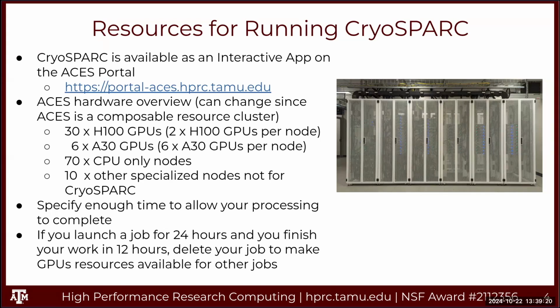When you do start a CryoSPARC job, make sure you specify enough wall time to process your files. It would be good to overschedule. If you plan on working one day, go ahead and schedule for 2 or 3 days, and then when you're finished working, you can cancel the job, so it'll free up resources. It's easier to cancel the job than to request a job extension on a Friday afternoon, hoping that the staff sees it before your job ends.